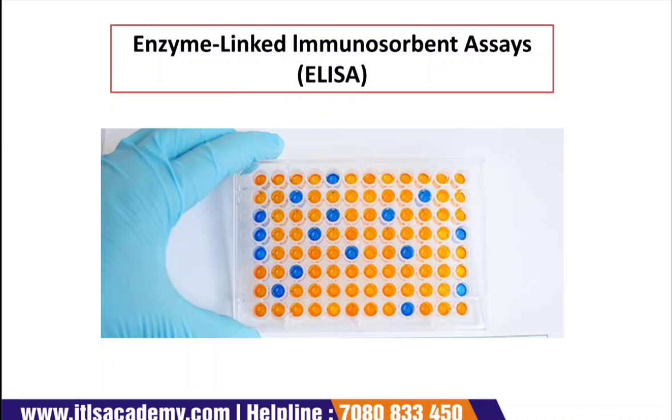It is very easy to use, the process is automatic, it requires very minimal sample preparation, and it gives the result very rapidly. These are certain characteristics that make ELISA used in most of the food industries.